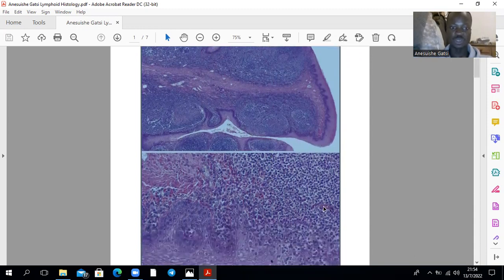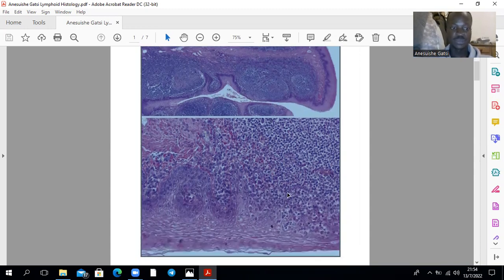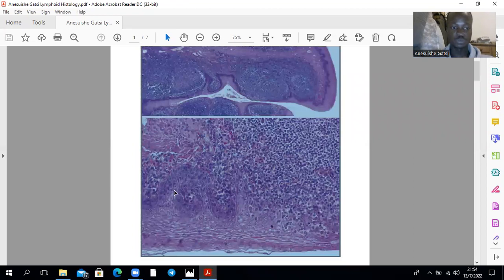Those are epithelial cells — that's a magnification showing epithelial cells. You can appreciate that this region here is a lymphoid nodule. That is simply a magnification of the tissue.